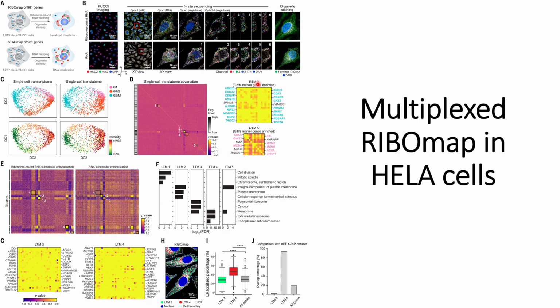So this conclusion can be interpreted from the results that we get from single cell transcriptome. Later they did the subcellular localization of the cells to identify whether the genes are expressed in particular organelles or not, and from this they also made the 5 LTMs, which indicate the co-localization proteins. I am not able to recall the exact full form.